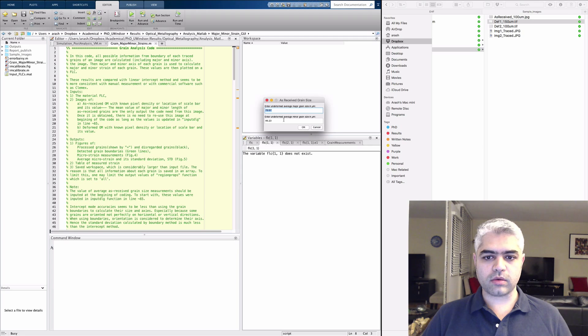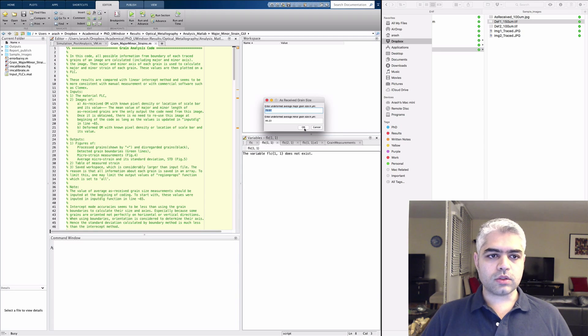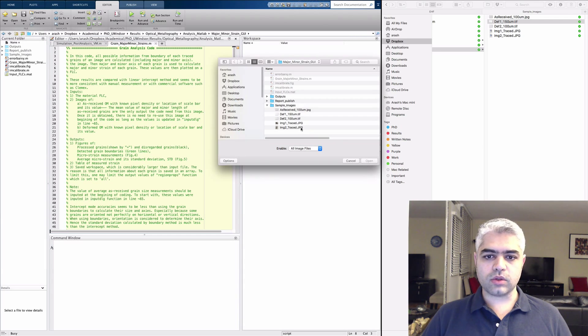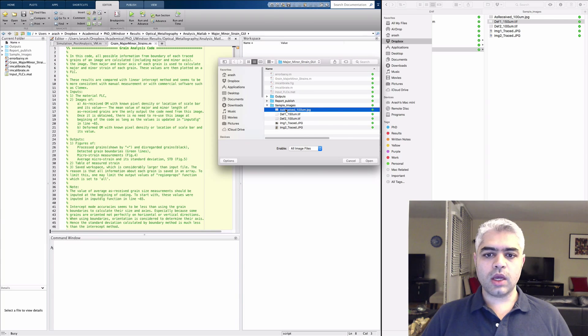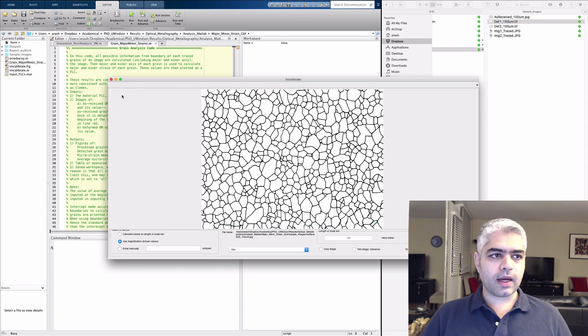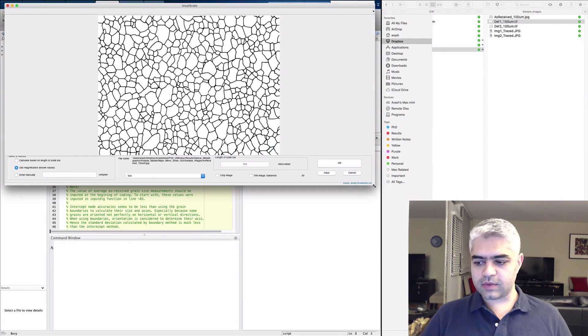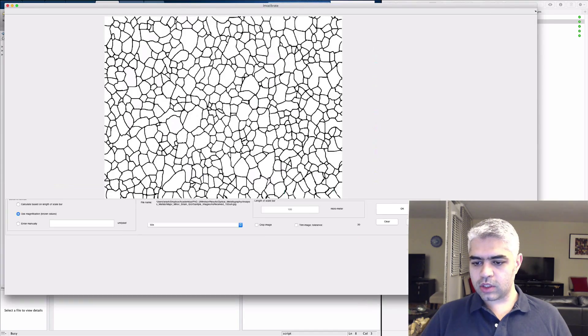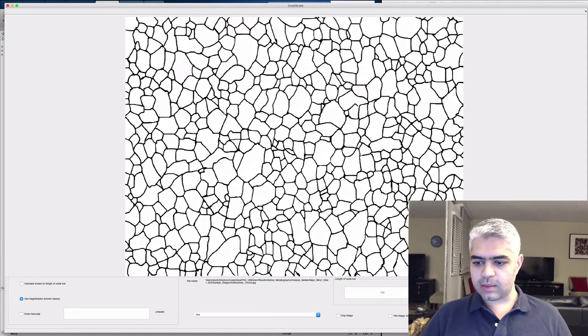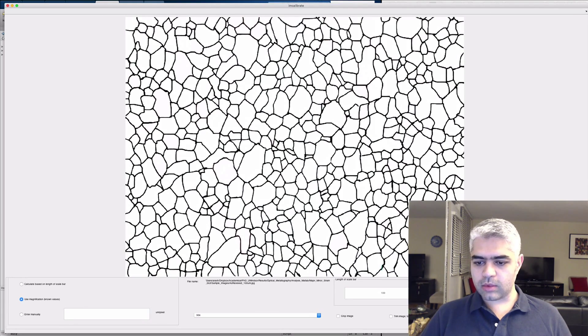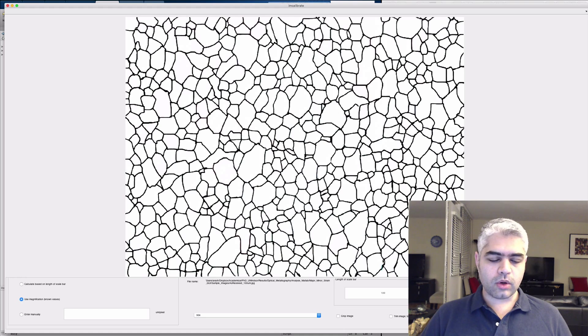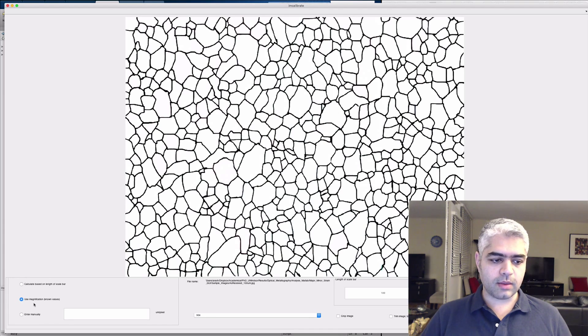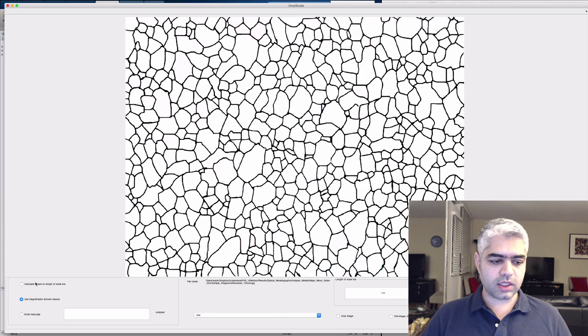Once I click OK, it's going to ask me for the image. Here I need to increase the size of this image so that I can see the scale bar. This subcode is designed in a way that it is capable of calculating the pixel density in three different ways.